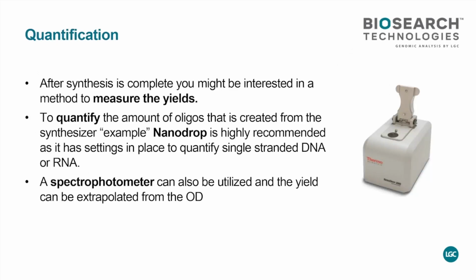Quantification doesn't matter much. You've been in the lab, you know what your 260/280 reader is. This little device is a NanoDrop, so this is for individual measurements. However, if you want to do 96 well plates, there are different OD readers, your 260/280.